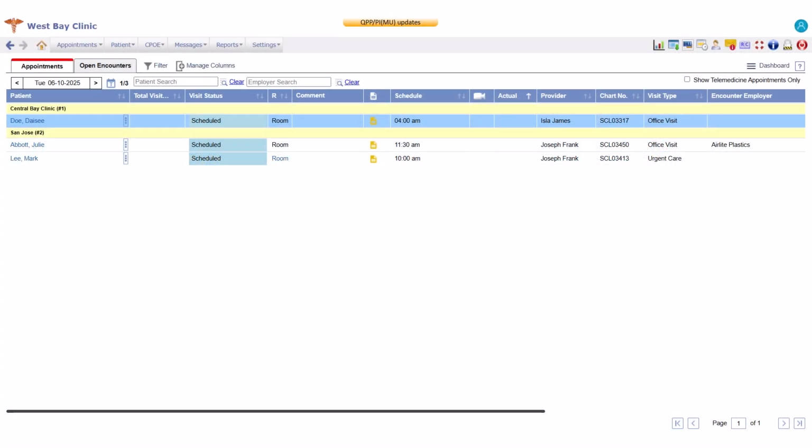Welcome to the Lab Interface Workflow video for Prognosis. In this video, we'll cover how to place electronic lab orders, review incoming results, and troubleshoot common issues.